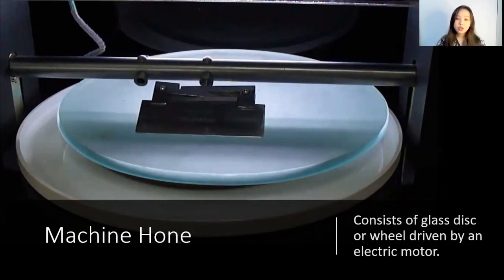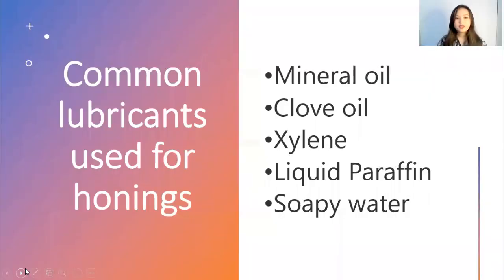So the wheel and the trough are then cleaned with soap and water for final polishing. And there are common lubricants used for honing, and these are mineral oil, clove oil, xylene, liquid paraffin, and soapy water. So we can see that microtome knives are very delicate and require great care and mastery.